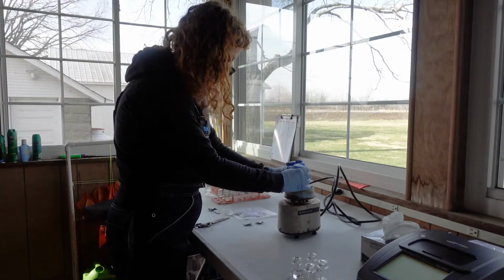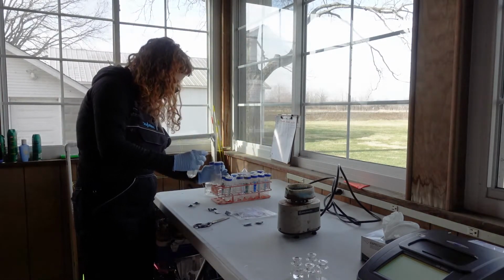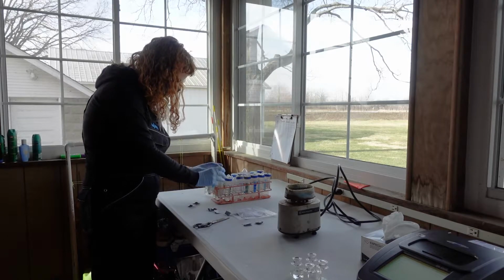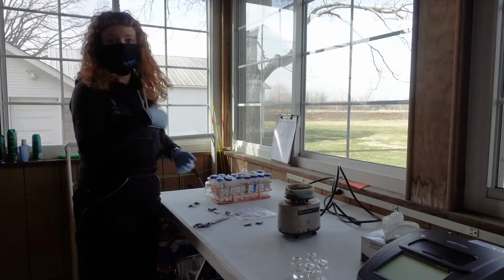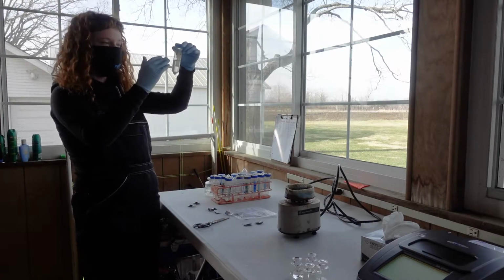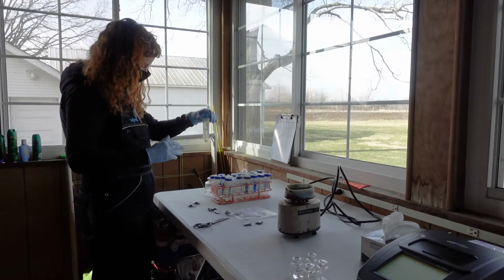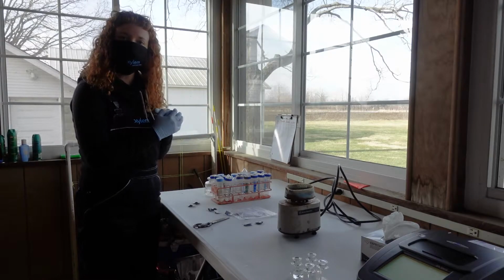All right, so it's been a minute. I've been spinning my samples. I'm going to return them to this tray and let them sit for 5 minutes. So for 5 minutes, the reaction will continue. What else will be happening is your reagent and your turbidity will be falling to the bottom of the tube. We'll show you what that looks like. All right, so after 5 minutes, we're going to read our samples.